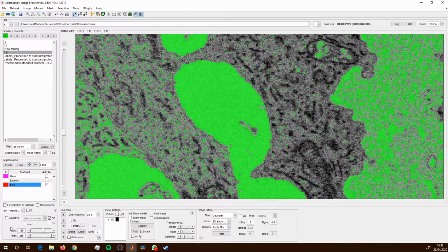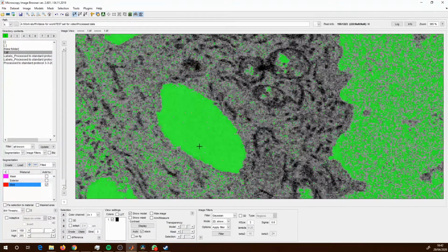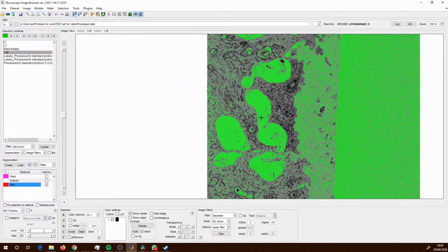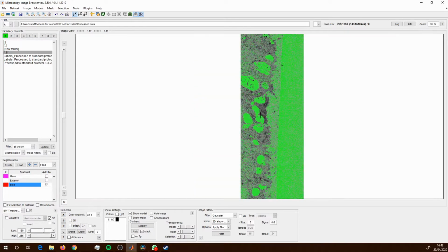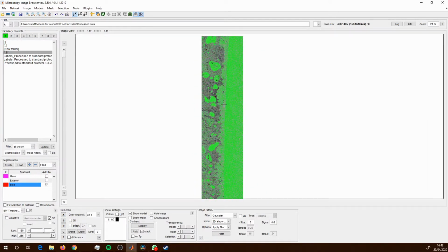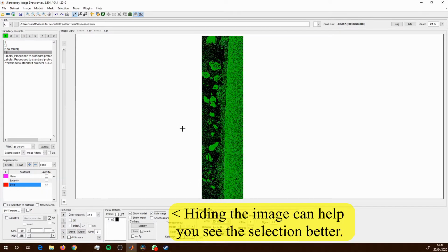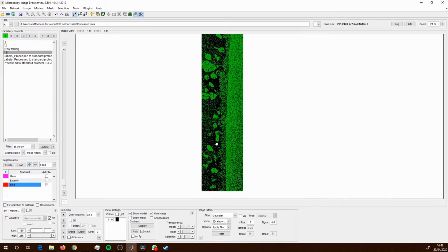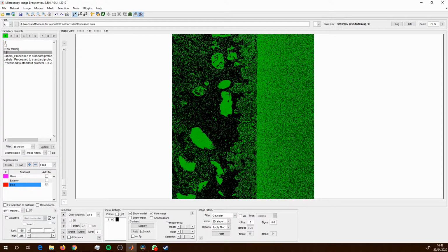Click the box for manually entering the threshold, the white area here where you can enter the text, and hit enter. What that'll do is apply this threshold to the entire dataset. If you zoom out now, you can see what it looks like. Hide the image as well. So, a quite nice segmentation of the objects we're interested in, these lighter areas here.